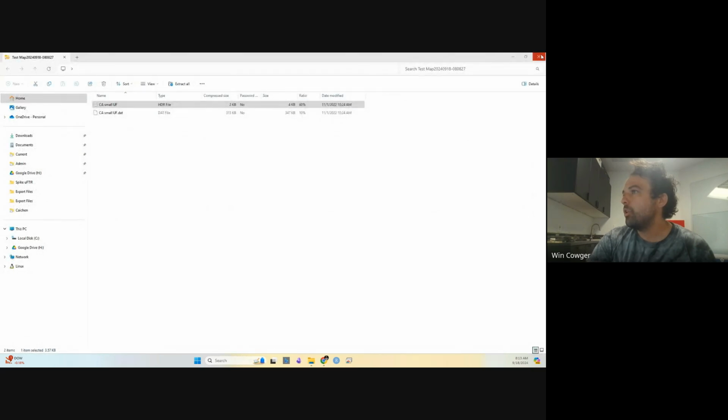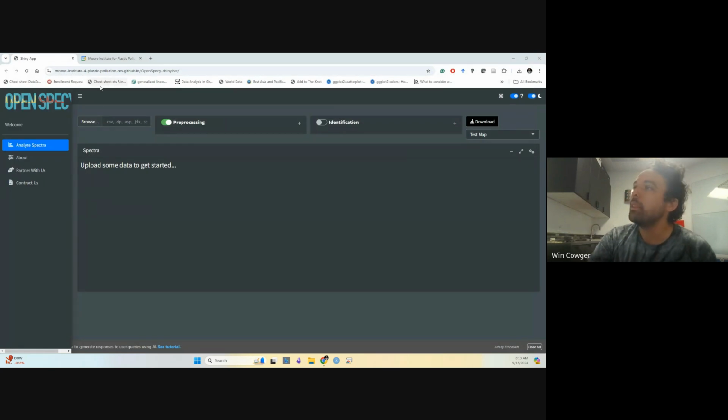All right, so if that didn't make sense, it will hopefully make more sense once we actually get this uploaded into Open Specy. Is this helpful? Pre-processing works fine in Firefox. Oh, thank you. That is very helpful. We'll look into that. We'll see if the pre-processing is working for me in my Chrome, because it could also be a Chrome version issue or something.